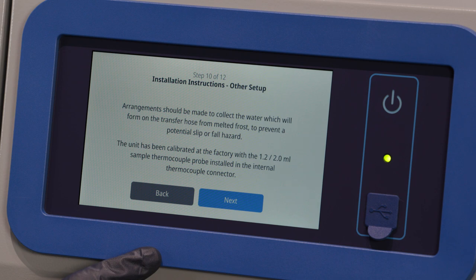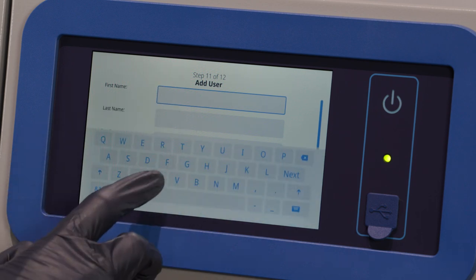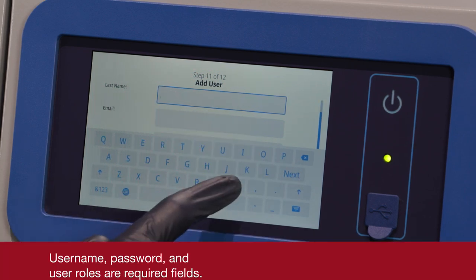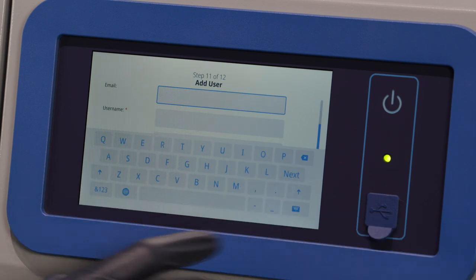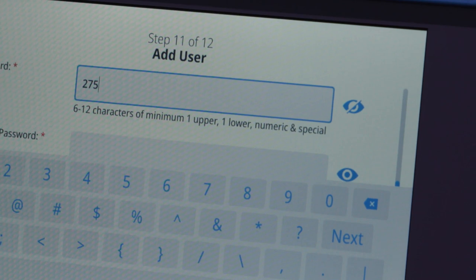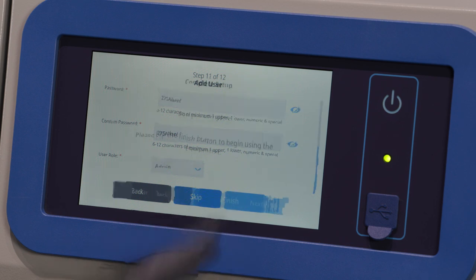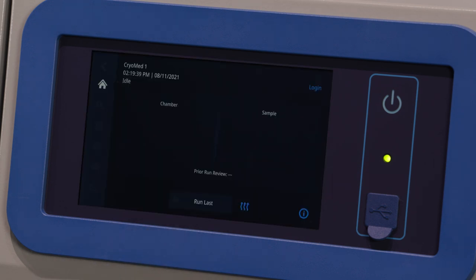The third and final installation instructions screen provides information regarding other setup and calibration techniques. Press the Next button after reviewing. In the Add User screen, you can add a user by entering the user's first name, last name, email address, username, password, and user role. If you press the eye icon, you will have password visibility. After entering all of the details, press Next. The Complete Setup screen indicates your initial setup is complete. Press the Finish button or the Back button to make changes.